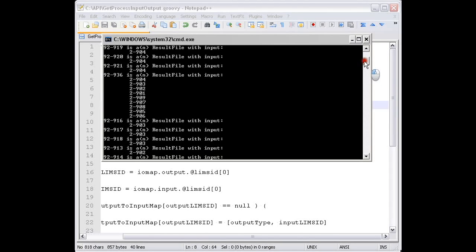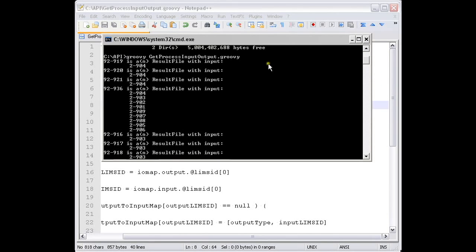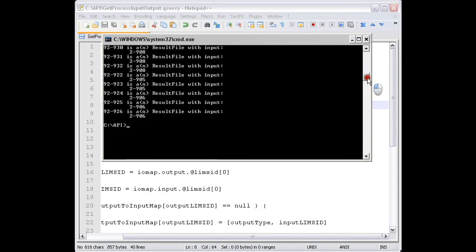if we go through this with a fine-tooth comb, we'll see that we've got lots of result file placeholders as analytes, or sorry, artifacts, and which inputs they relate to. And then we've got this one, which clearly, since it relates to many inputs, is the shared result file, and then we've got the remainder of the other result file artifacts.